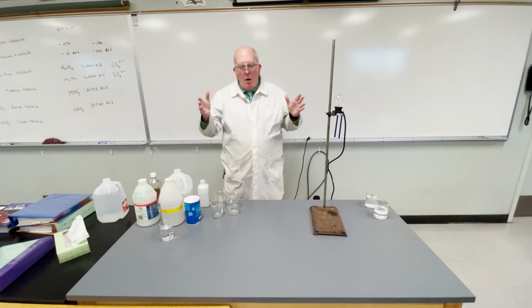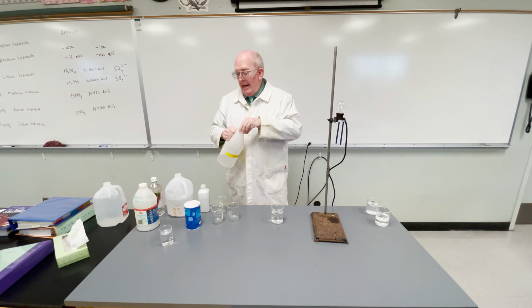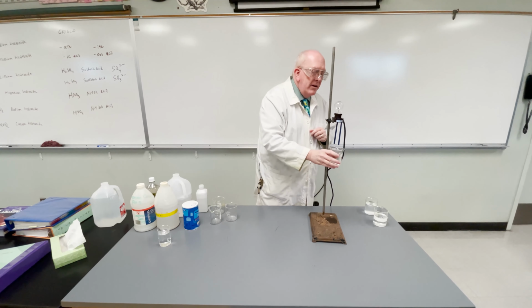Let's take this now to acids and bases. We have strong acids, we have weak acids, strong bases, weak bases. This is a strong acid, hydrochloric acid. And what I'm going to do, again, get a bunch of it in the beaker. It, being a strong acid, should be fully dissociated, which means it should be a good conductor of electricity.